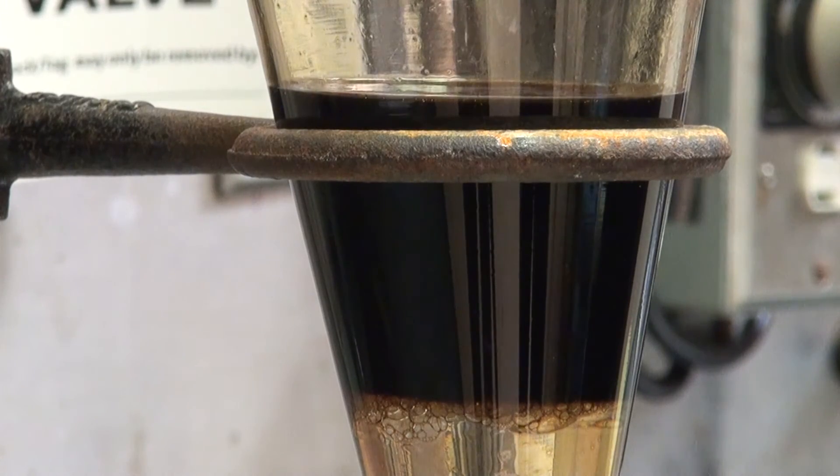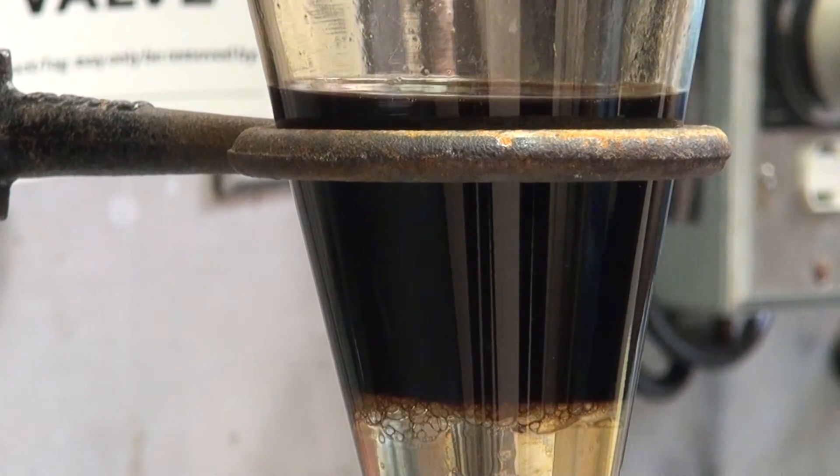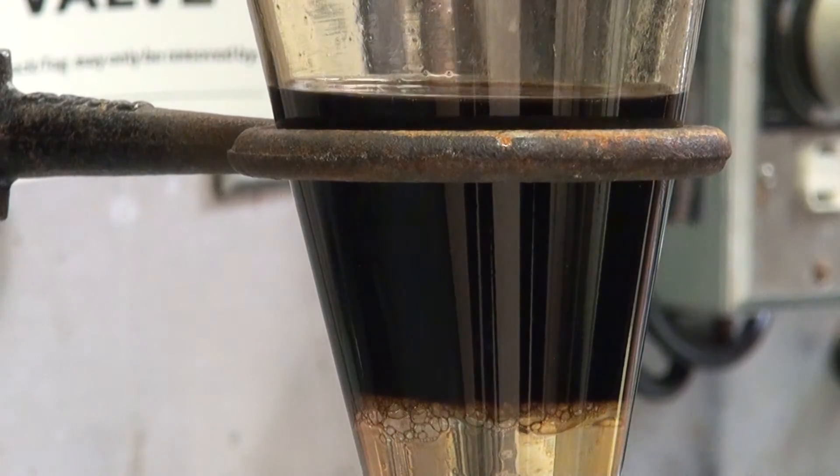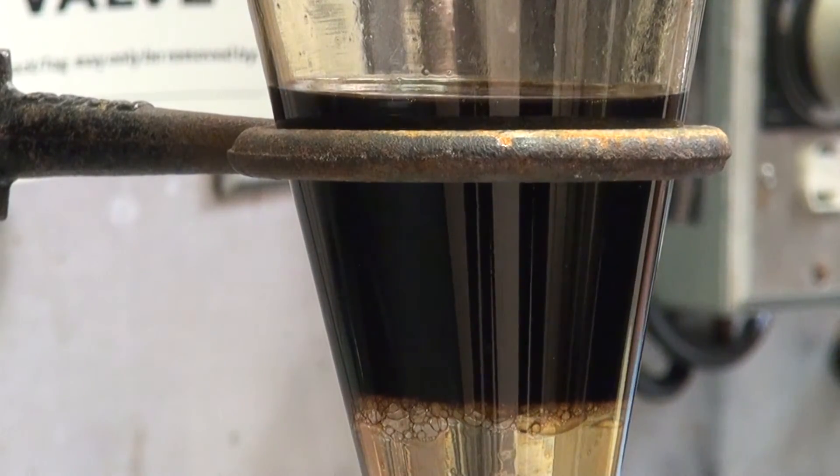Also here, you can do the drop test to know which layer is which. If you add a drop of dichloromethane, you can follow it to the bottom layer.